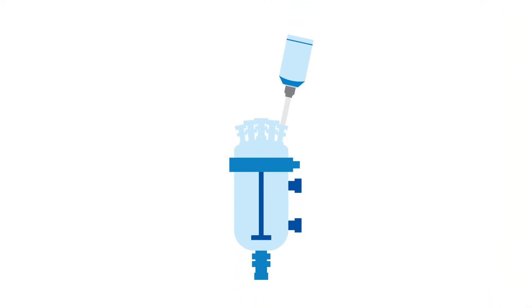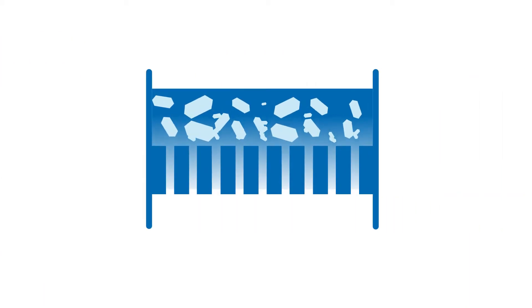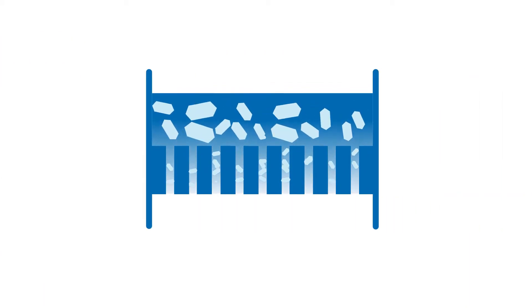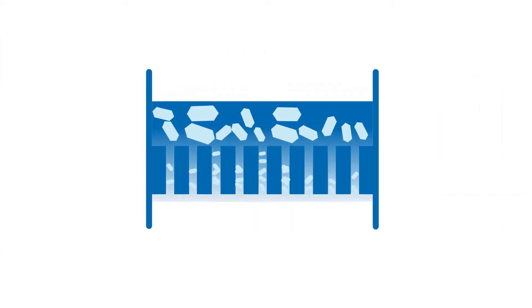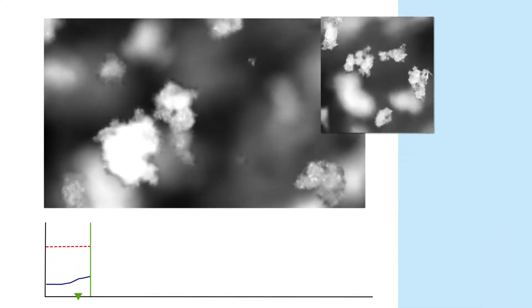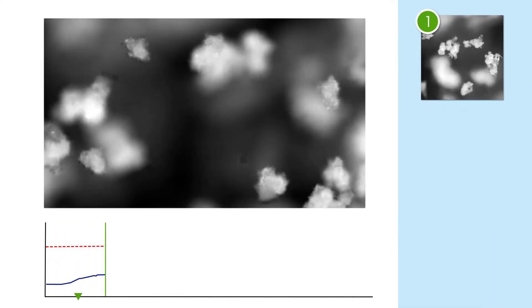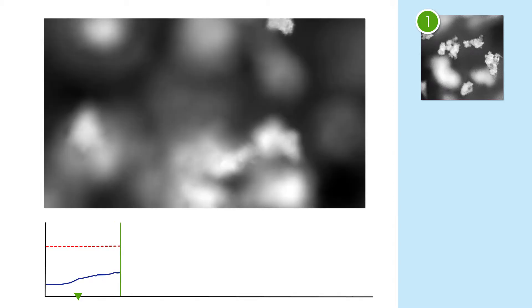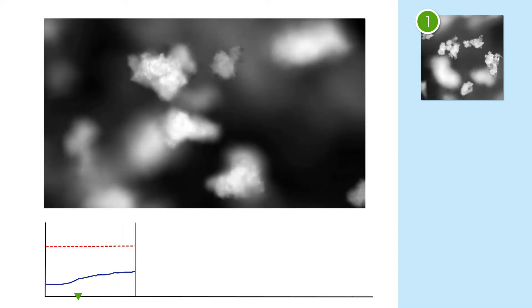For this crystallization process, real-time microscopy was used to understand the mechanism that was causing slow filtration of the isolated material. The first important crystallization mechanism that was observed was the growth and agglomeration of the seeds soon after they were added to a supersaturated solution.